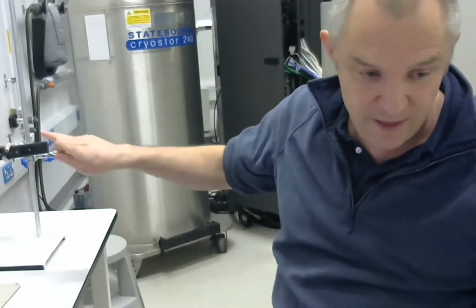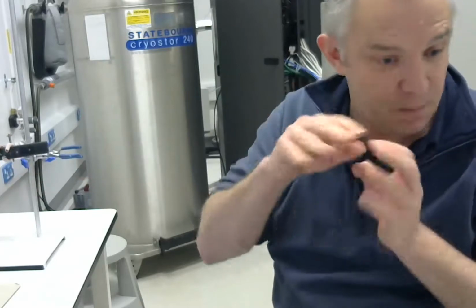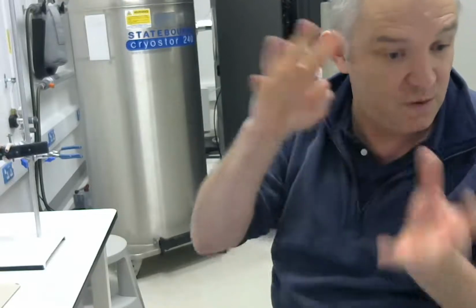Now, when we fire the laser at that grid, the waves of light are going to be diffracted by the grid spacings. So that instead of seeing the grid pattern, what you see is this pattern of spots, just as you would with the salt. And in order to do that, I need to change so that you now see this image, hopefully.